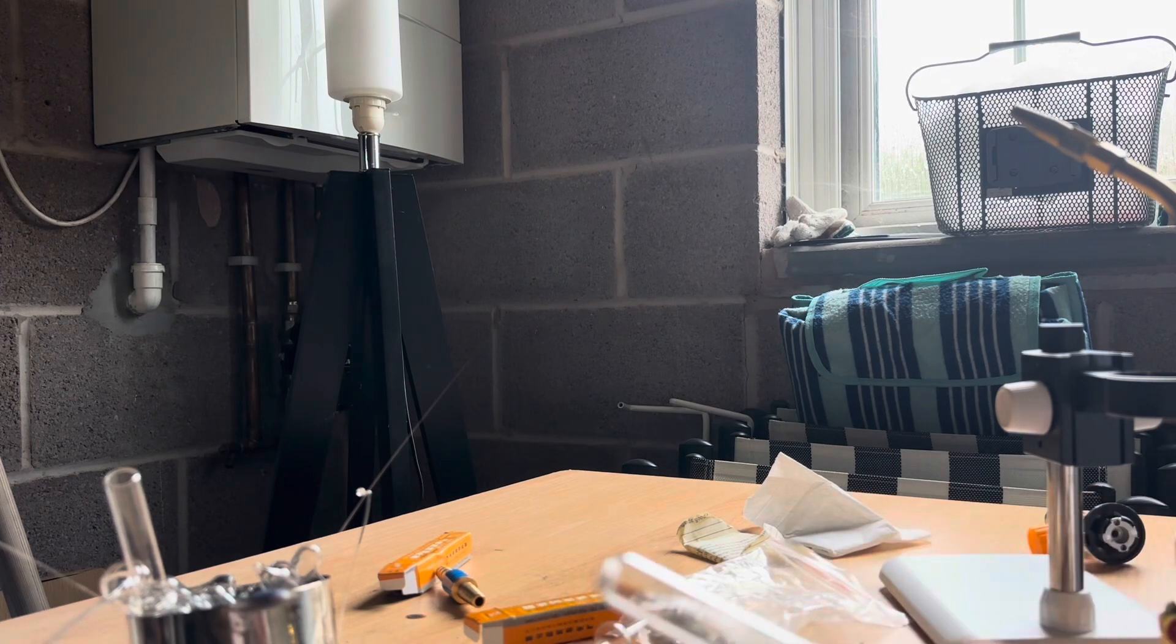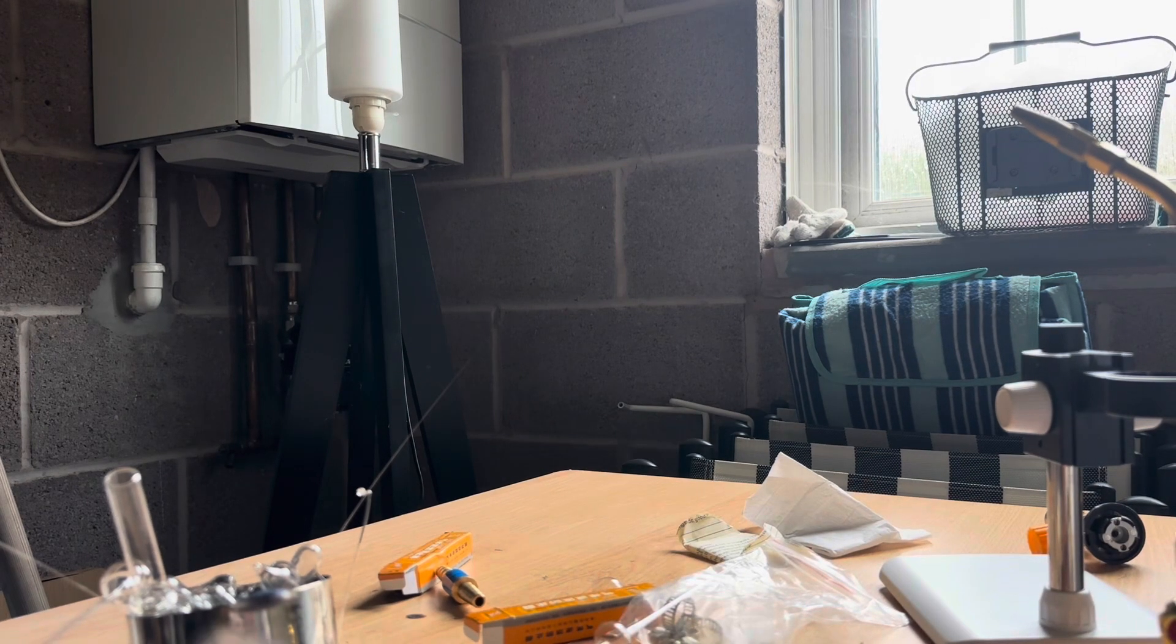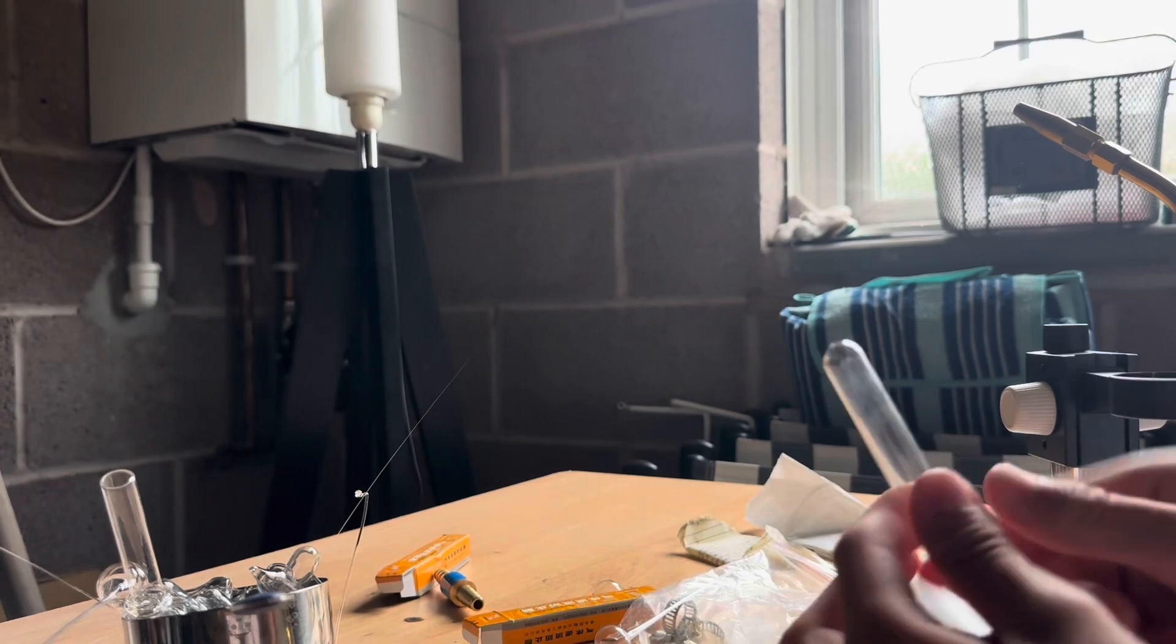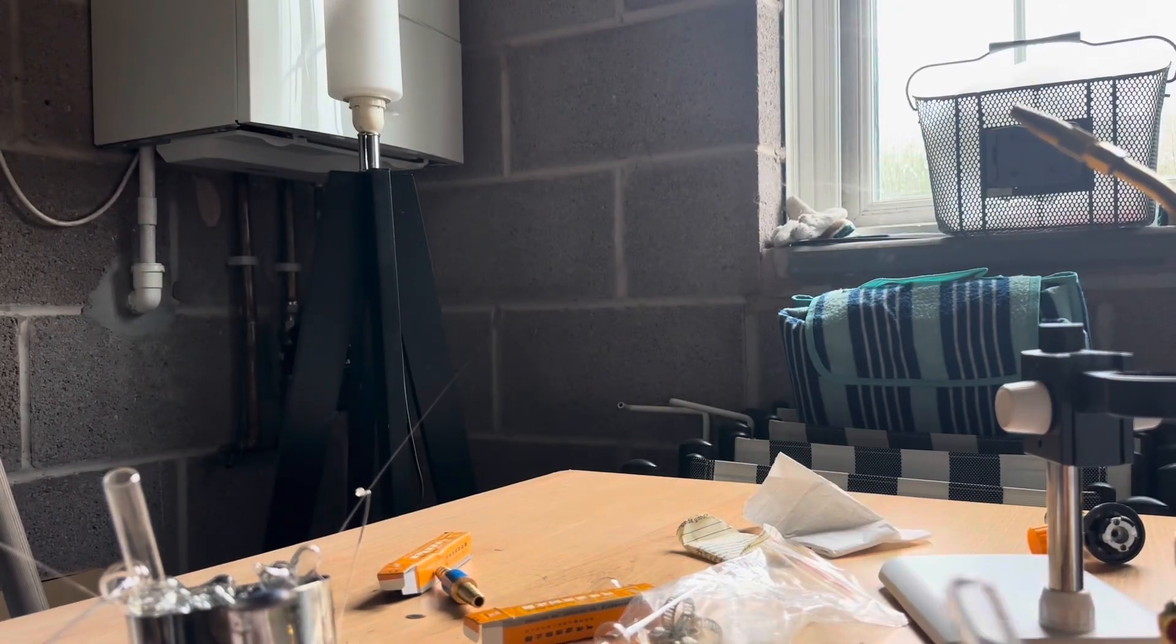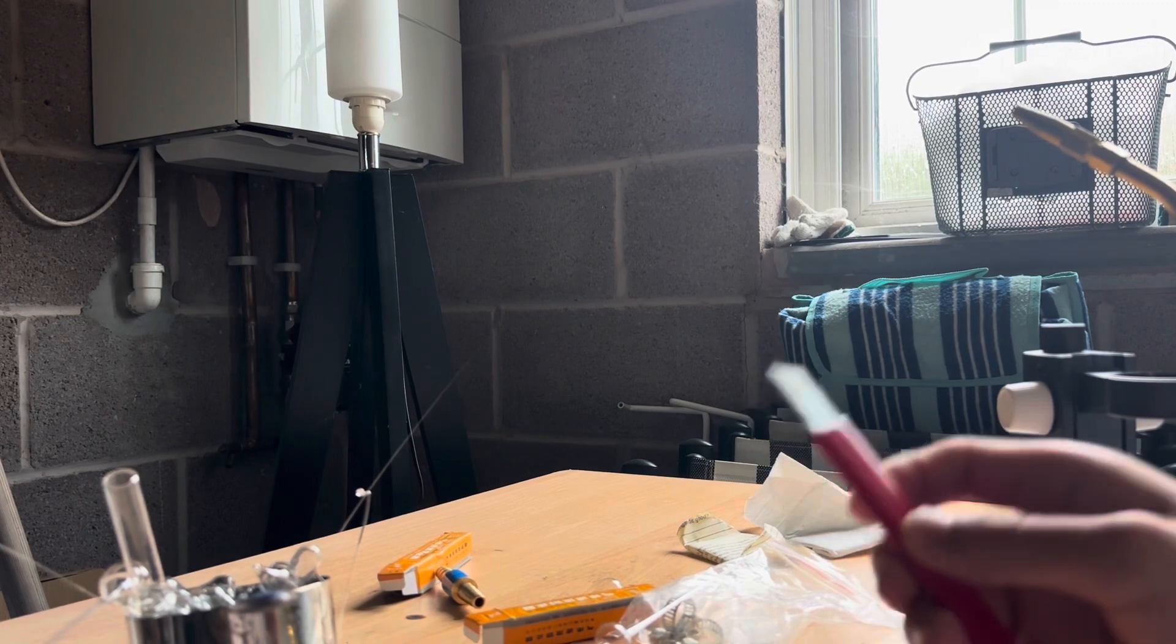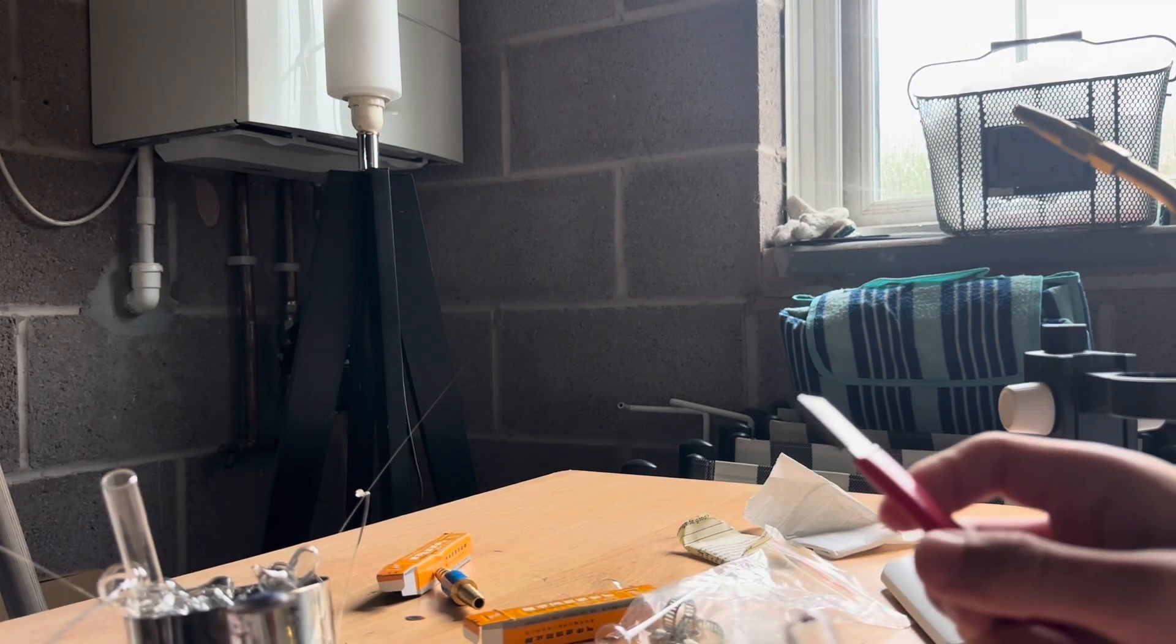Here, I have a thick section of a glass tube, as you can see here. I want to remove the top section of the glass tube off. To do this, I will have to use something called a carbide scribe.